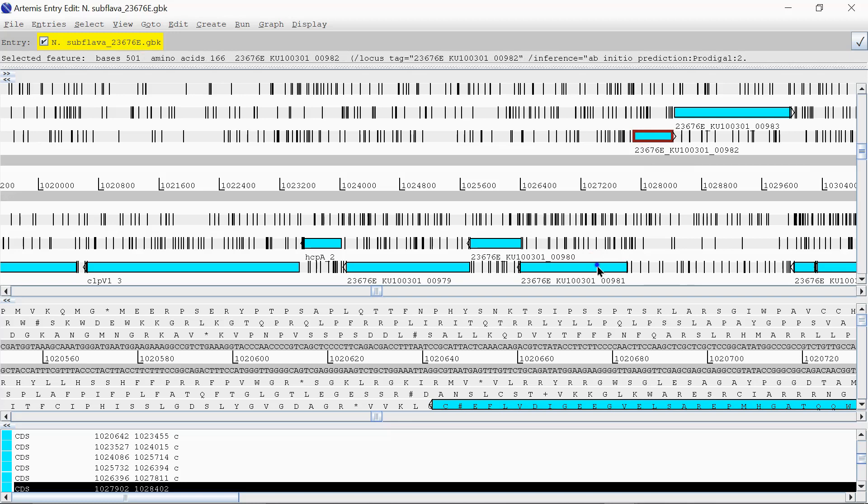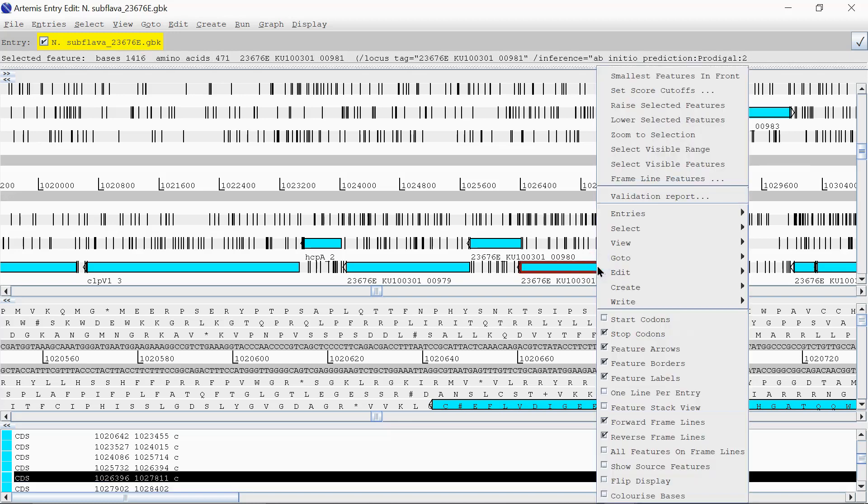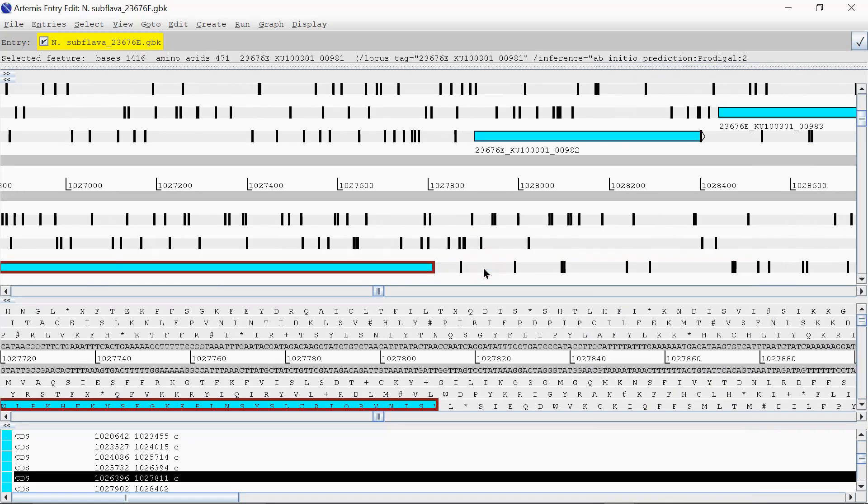You want to zoom in on this, and just right-click, and zoom to selection. And if you double-click on that, it will then align, obviously, the top and the bottom.